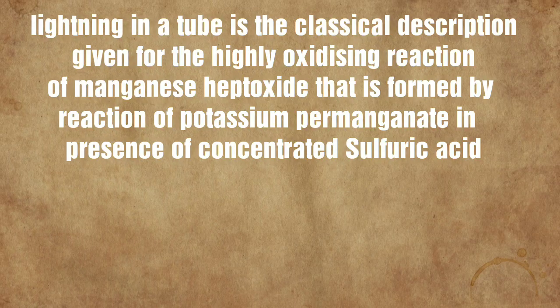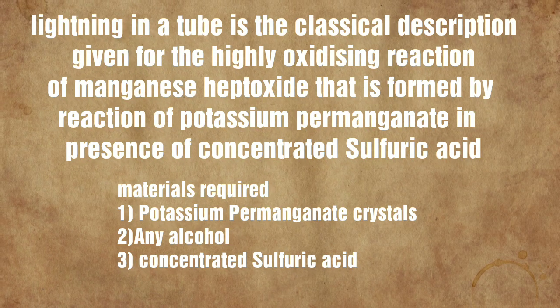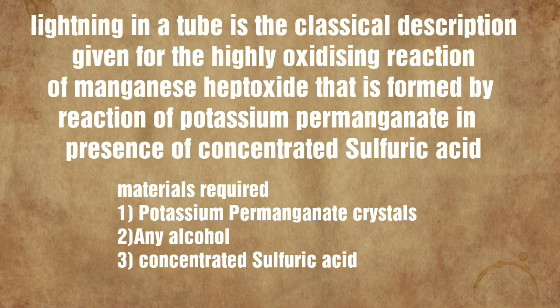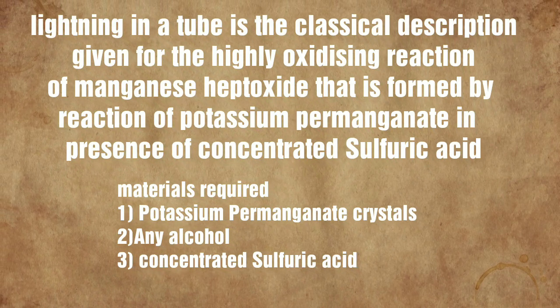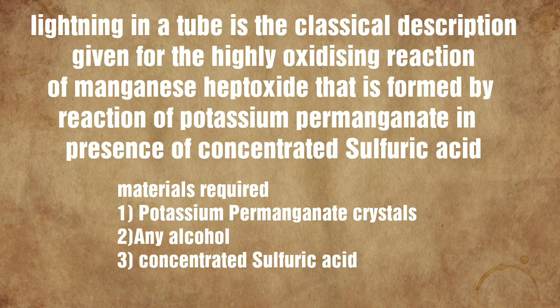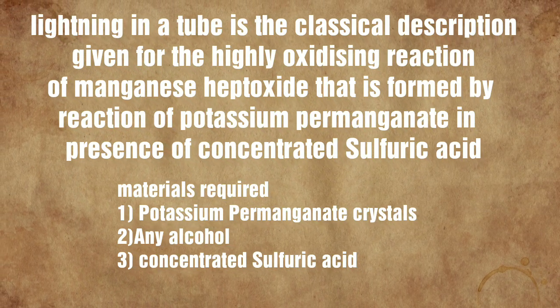Let us begin with the experiment. 'Lightning in a Test Tube' is the classical description given for the highly oxidizing reaction of manganese heptoxide.